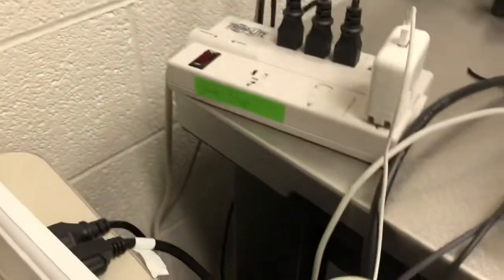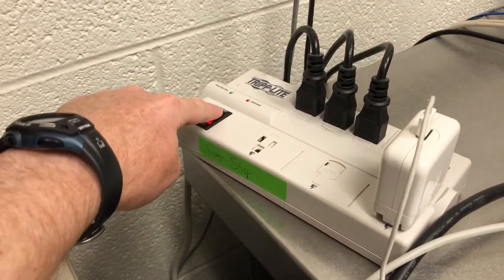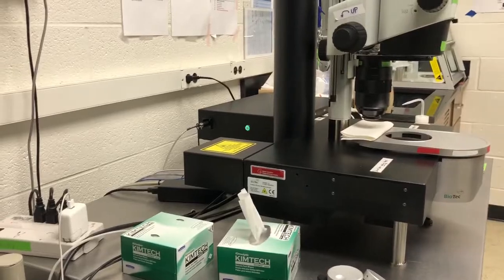The next step is to turn on the power strip. The power strip is here — it's labeled, as you can see. It's labeled green, so we should only touch it with ungloved hands. When you turn that on, you can hear some noises — that's perfectly fine.